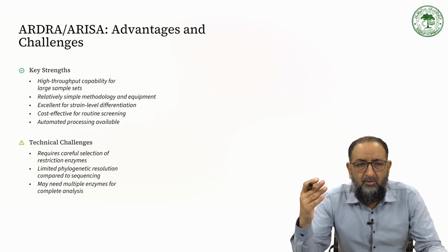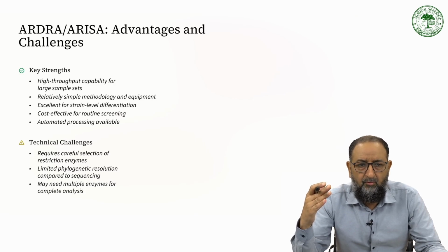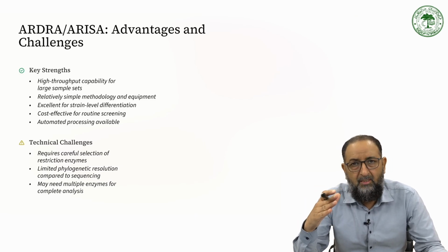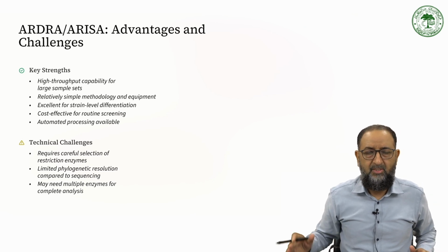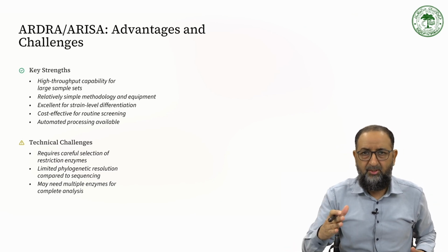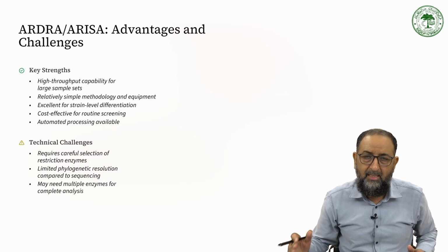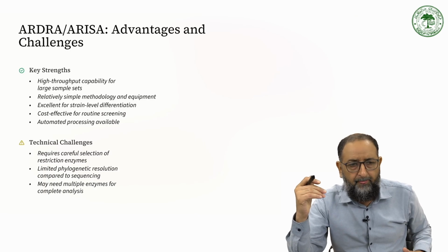Now, though these are the strengths, one thing I would like to share with you is the skill requirement. This technique requires a lot of skills because you need to design primers, and then you have to do the sequencing, and then you have to do restriction digestions and run a gel. So it needs good practice and good skill development with a technical background.